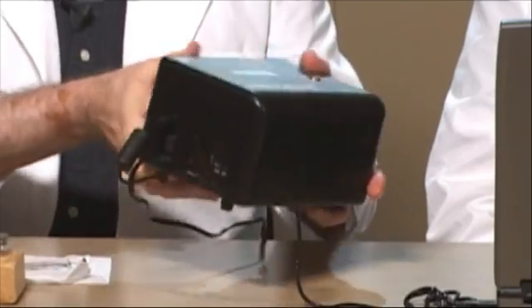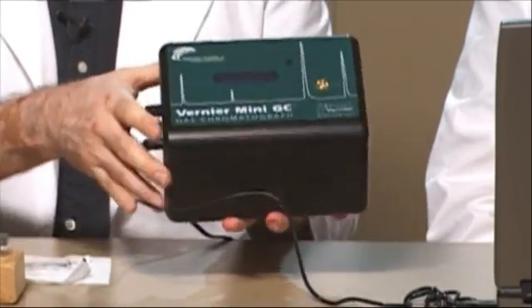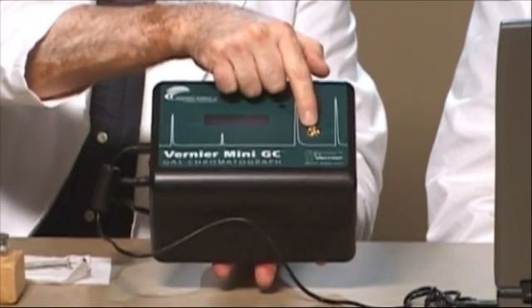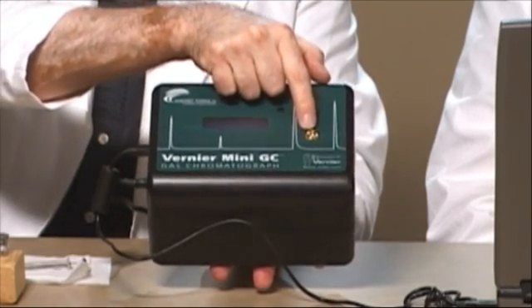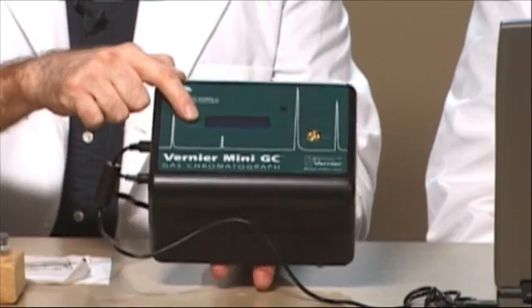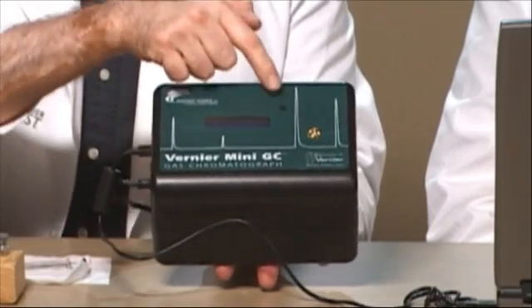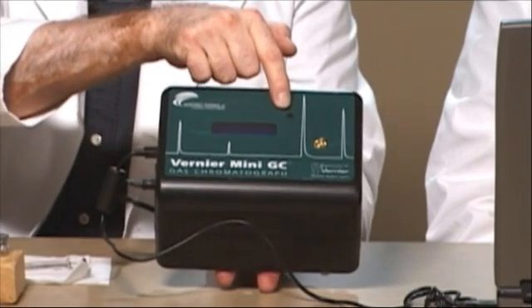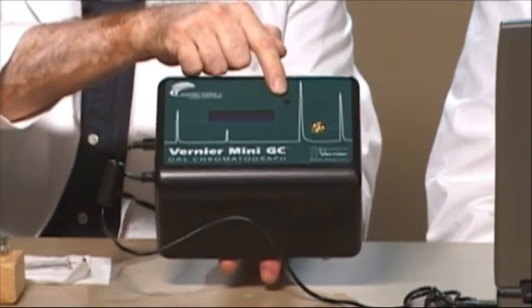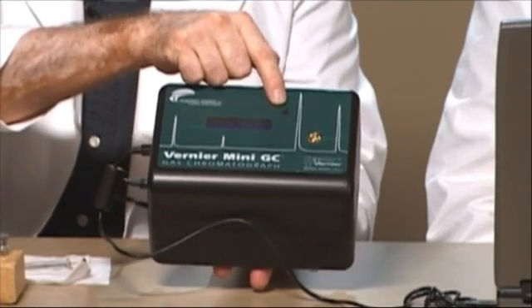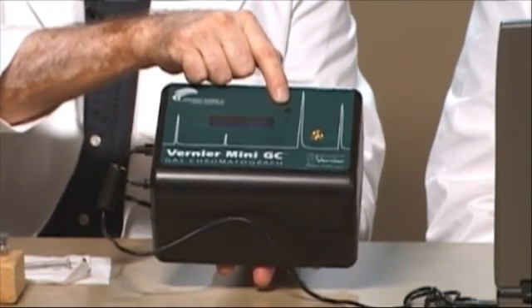There are a couple of items of interest on the top. There is an injection port here where the samples are inserted into the device, and then a little viewing screen that gives you an update of temperature and flow rate. Next to the viewing screen is a little LED that shows you the status of the device. It's either red if it's in pause or getting ready mode, and green when it's collecting data.